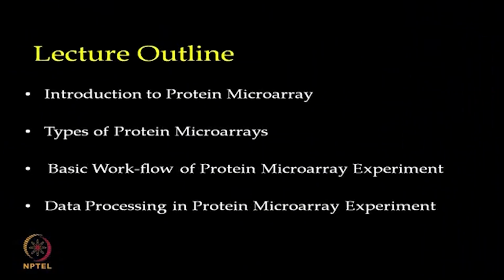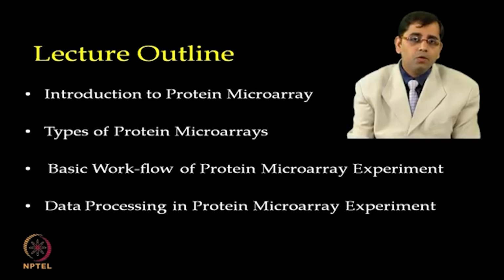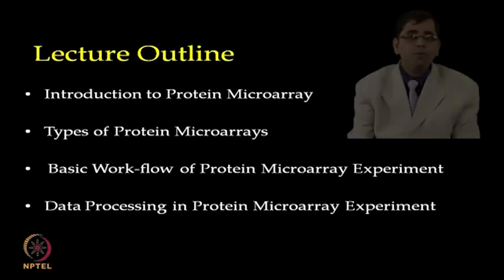In today's lecture, we will discuss some of the high throughput approaches for studying protein interactions which use different types of protein microarray platforms. We will cover a broad introduction of powerful protein microarray platforms, discuss various types of protein microarrays, understand the basic workflow of any given protein microarray experiment, and go over the basic steps involved in data processing in a protein microarray experiment.